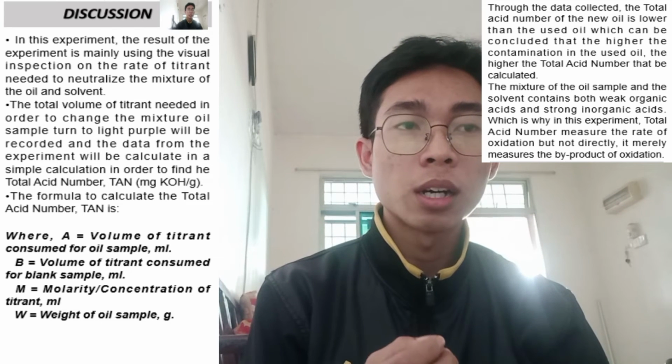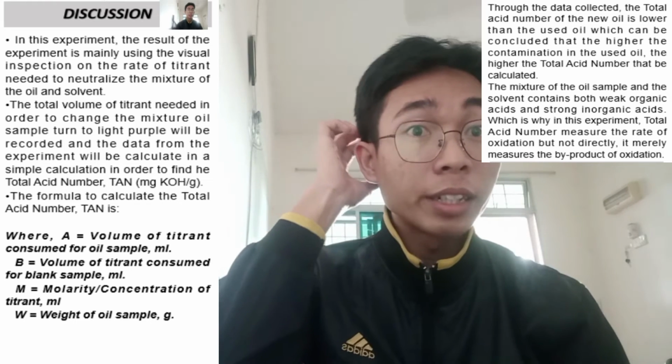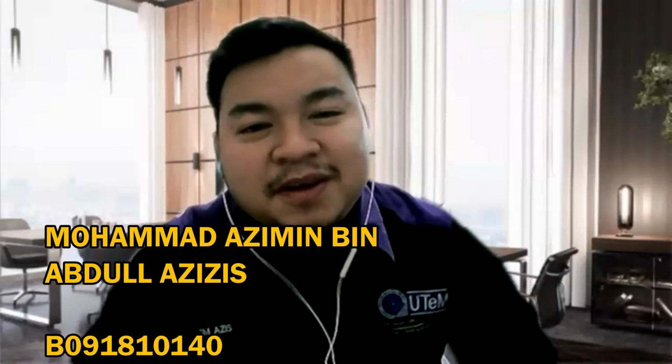We just calculate the volume of titrant needed to neutralize the mixture. So it merely measures the byproduct of oxidation. So that's all from me. Thank you.